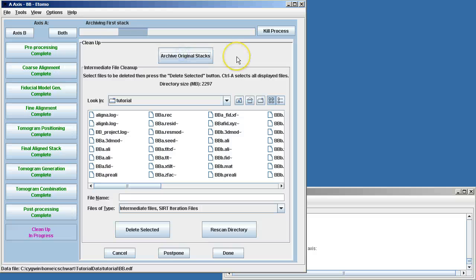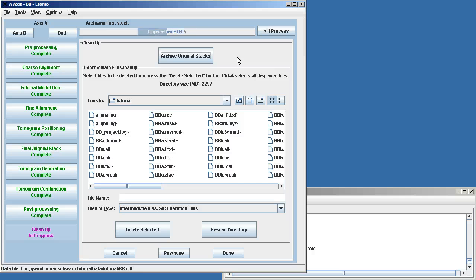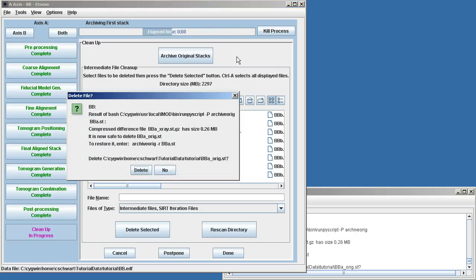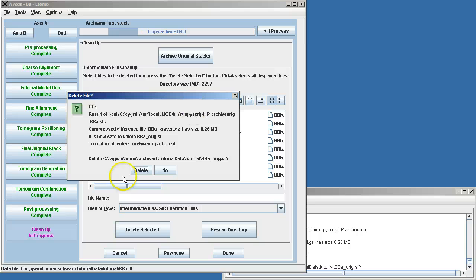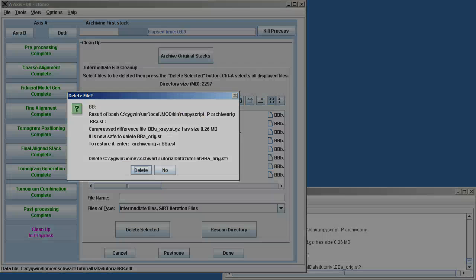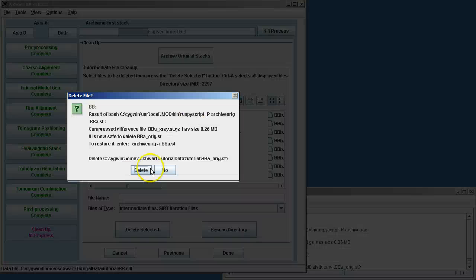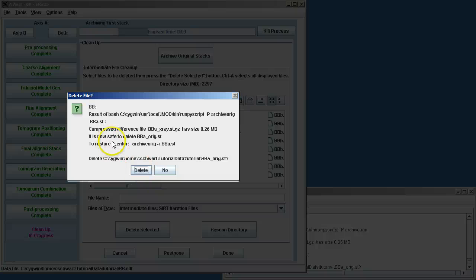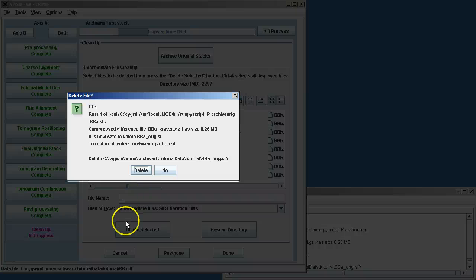So now we can archive original stacks. This allows us to get rid of extra material that we don't need. For example, here what happens is you have an original .st that was saved. That original .st contains all of the x-ray information. But we've been using the one that has x-rays removed, and so we don't need to keep two complete stacks.